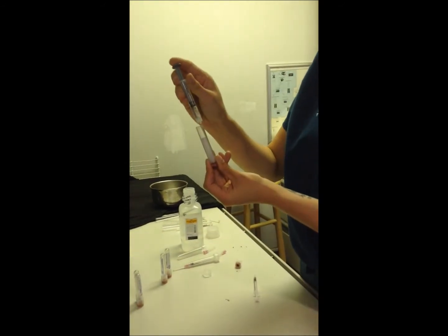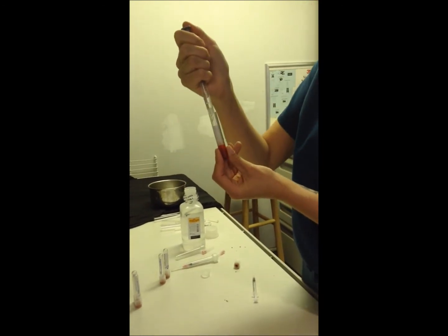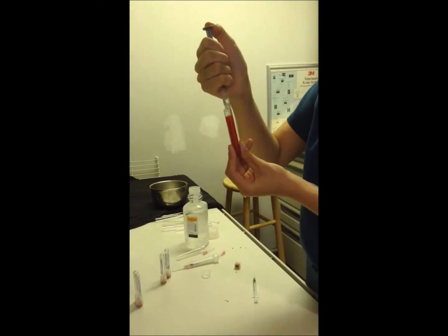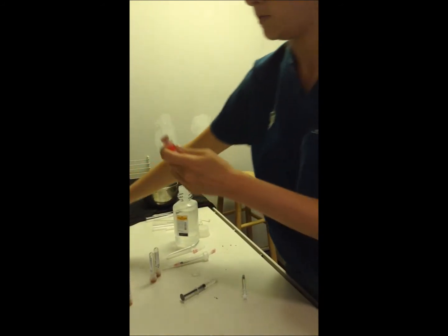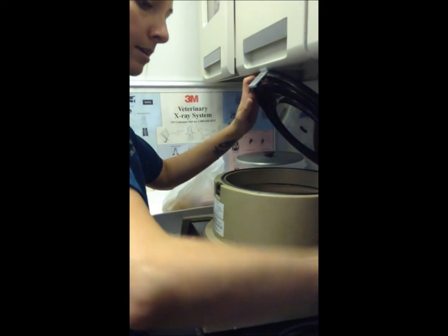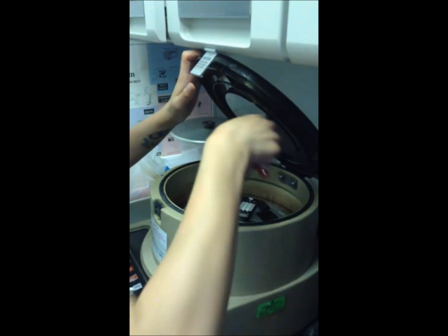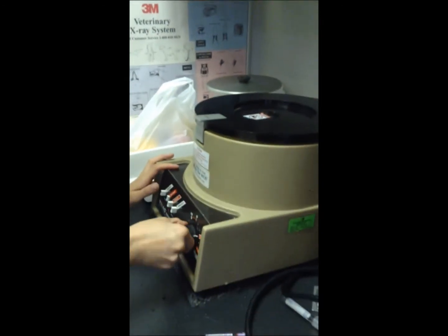One more time, we're gonna fill this one up, and then we're gonna spin them down, and then remove the red blood cells, and stick them in another vial. Okay. So, we're gonna spin these down. So we're gonna place these in the centrifuge for 1 minute.